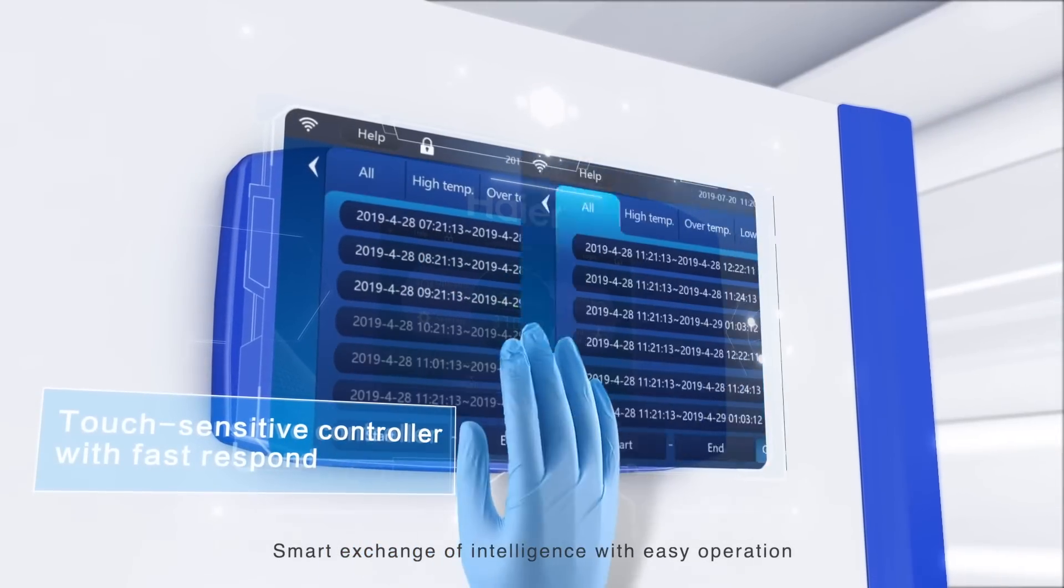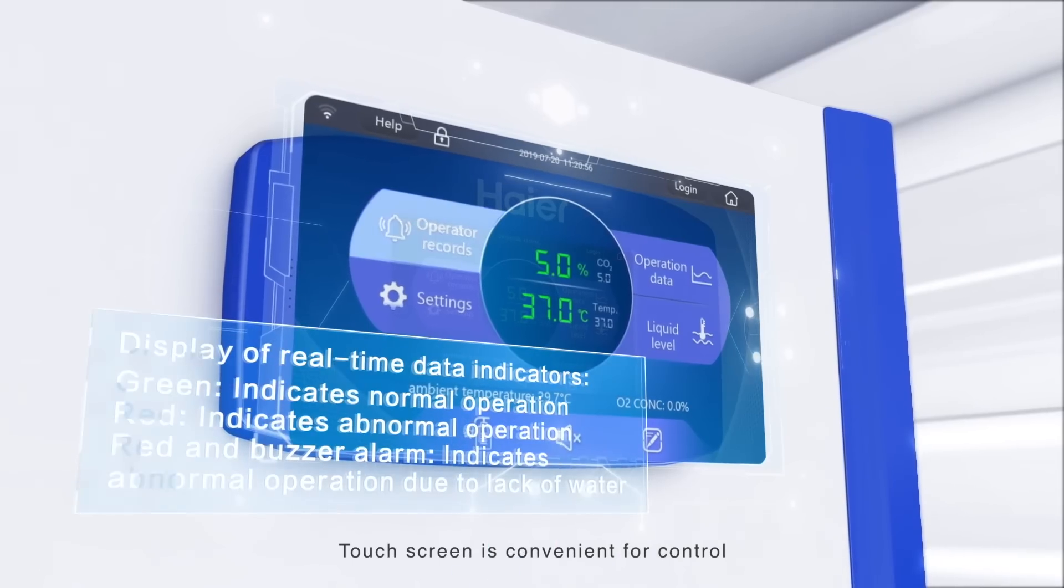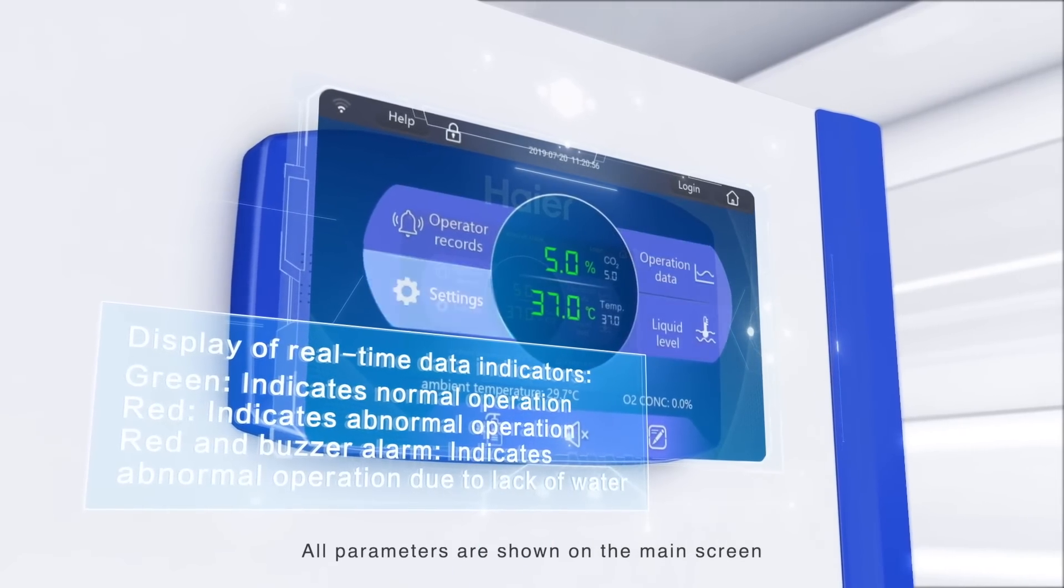Smart exchange of intelligence with easy operation. Touch screen is convenient for control. All parameters are shown on the main screen.